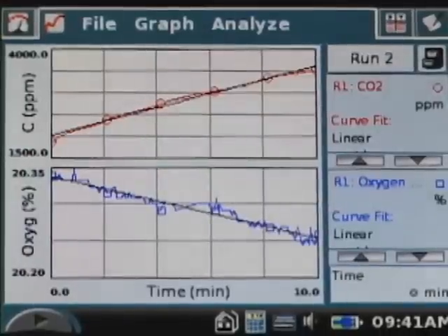As you can see, the graphs clearly indicate that carbon dioxide is being produced and that oxygen is being consumed while the peas are in the respiration chamber. Some variations on this experiment could include investigating the effect of temperature or the number of peas on the rate of respiration. This experiment lends itself very nicely to inquiry.